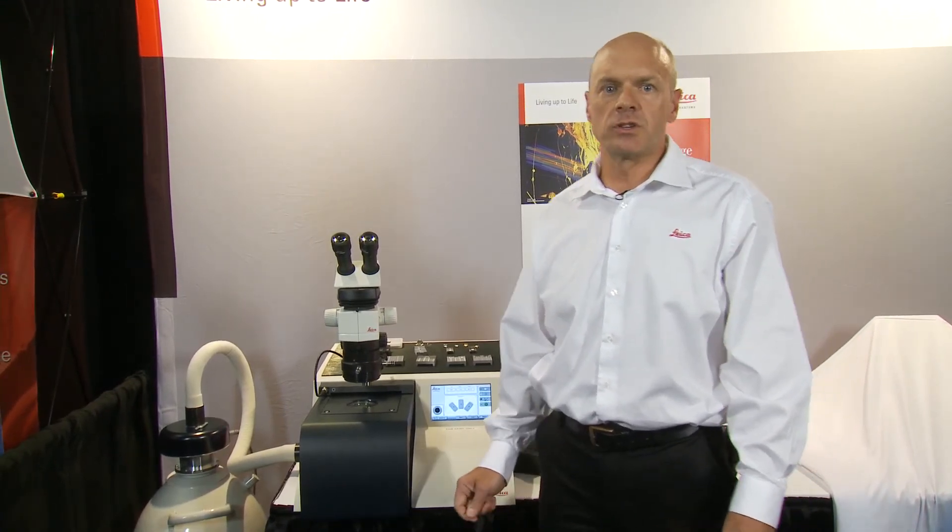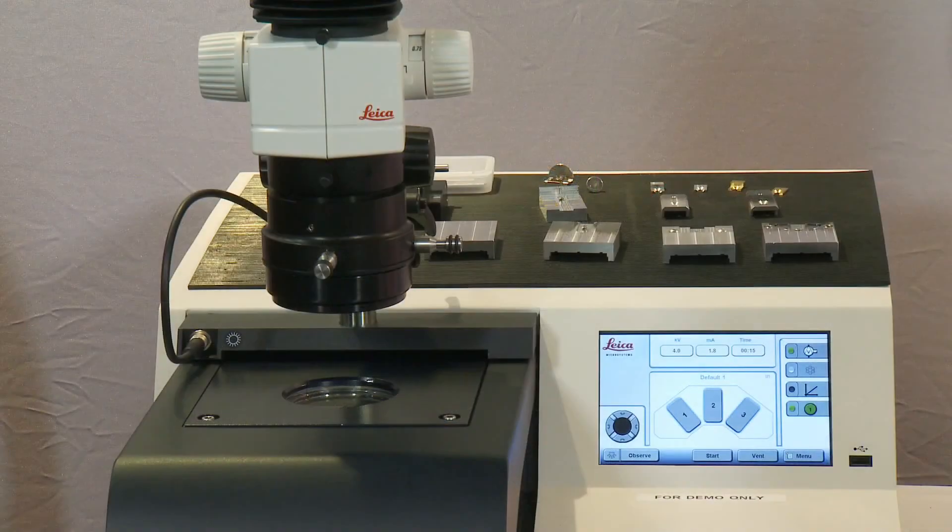We also have a new stage coming out in the next month or so that will allow us to work with sample modification. We'll have an ability to polish very flat samples that are as wide as 25 millimetres in diameter. This is our TIC-3X Ion Milling System.